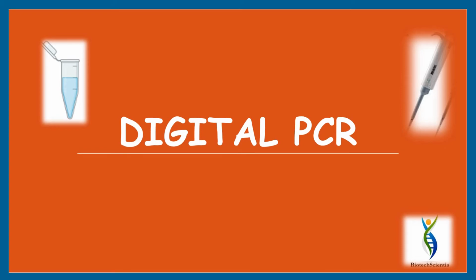Today we learn about third generation polymerase chain reaction, that is digital PCR.